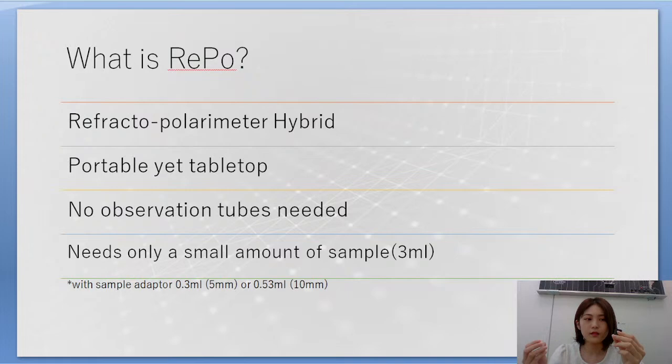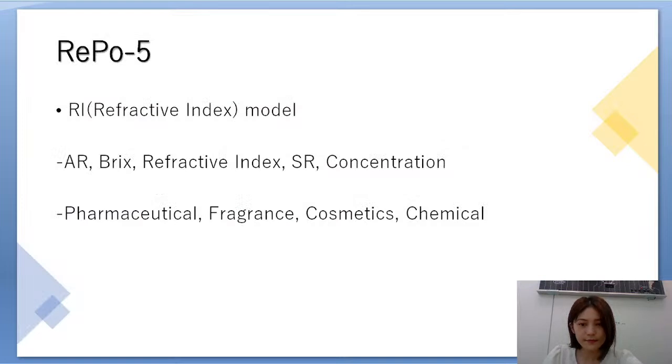The adapter looks like this — it has a glass cell, and you put the two parts together and place them onto the sample stage to measure. REPO5 measures angle of rotation, refractive index, specific rotation, and concentration. It is used for pharmaceutical, fragrance, cosmetics, and chemical industries.